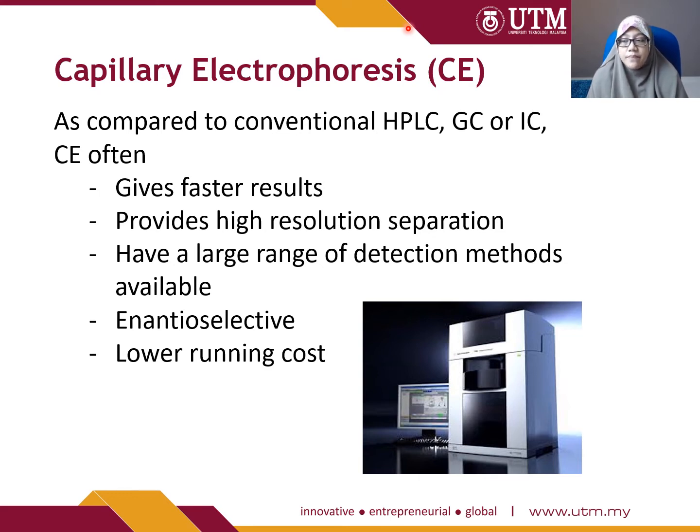Tapi you have to have good voltage, good current, because the separation is based on current kan. So you have to have a good setup, good current, good parameters before you can get high resolution of separation.